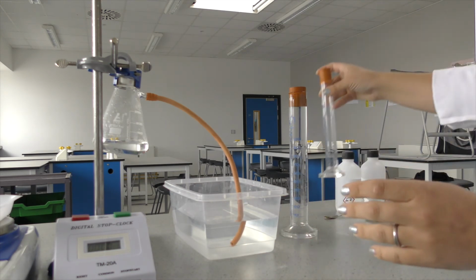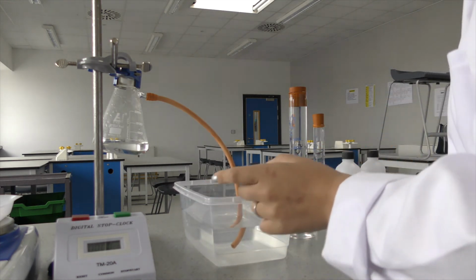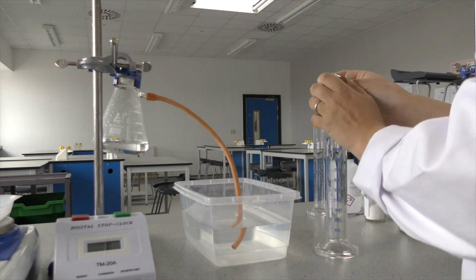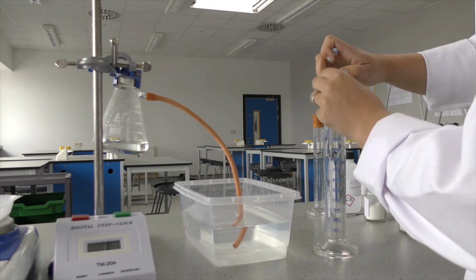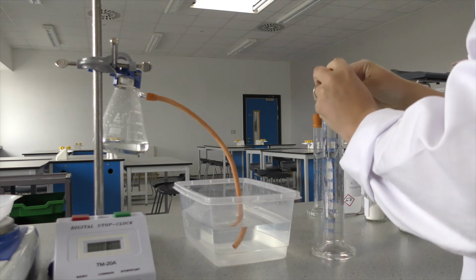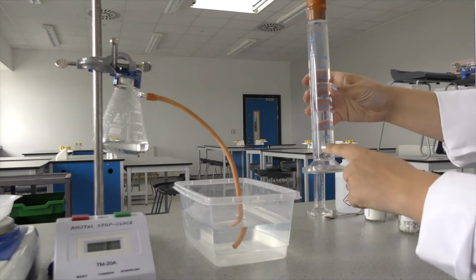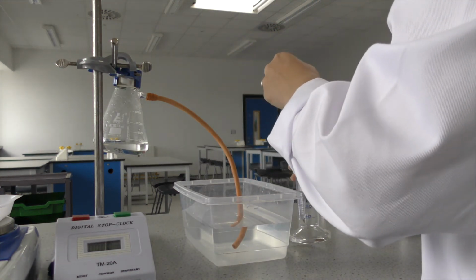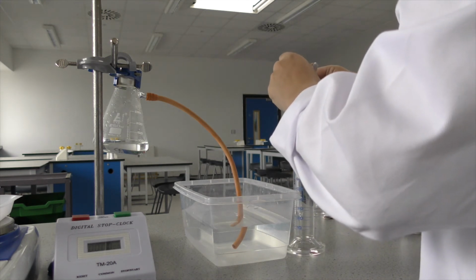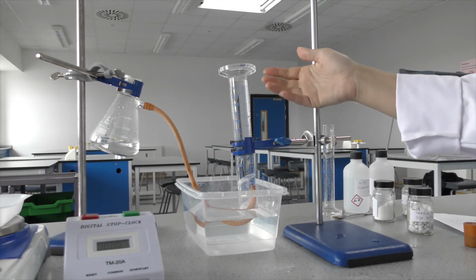And what I'm going to do is set this up ready so that we'll be able to measure the amount of gas released when we do the experiment. So this part is a little bit fiddly, hopefully I can get it first time. I have to be quite quick with it. So I'm going to place this in. And hopefully it should work.